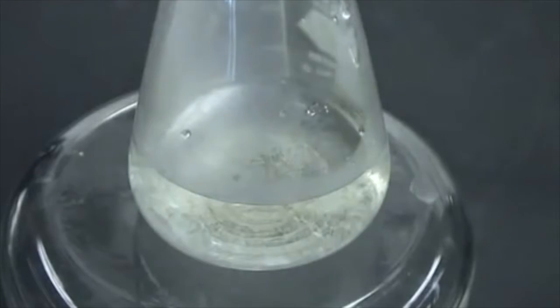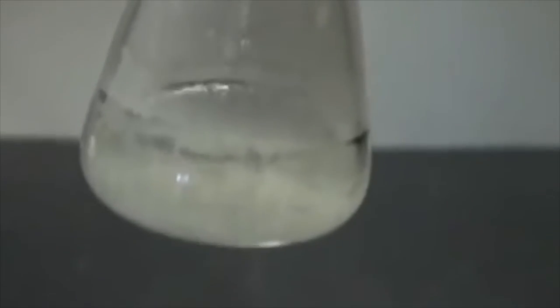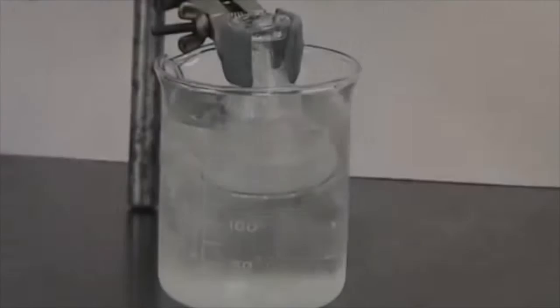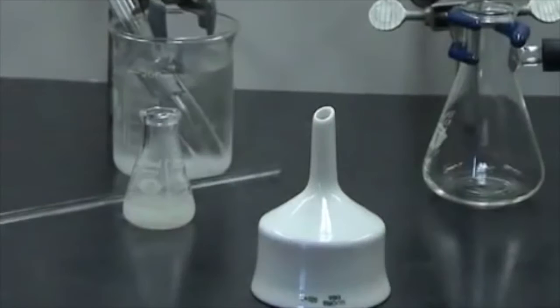Now the solution is removed from the hot plate and allowed to cool to room temperature. After the flask reaches room temperature, we have a reasonable crop of crystals. As you can see, crystals are all over the solution. But we still need to transfer this to an ice water bath to complete the recrystallization process. We'll collect our crystals by vacuum filtration.